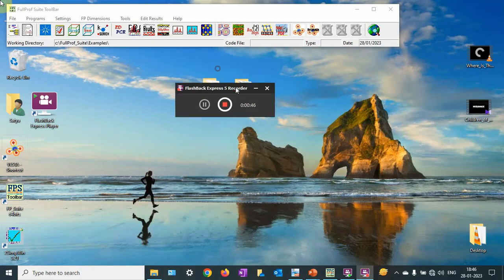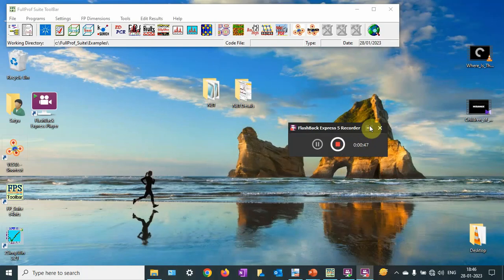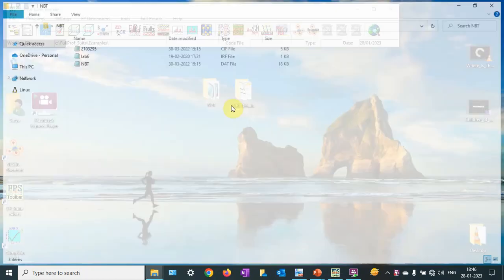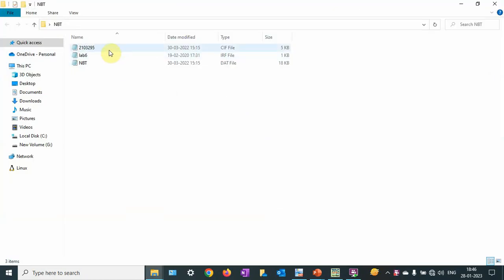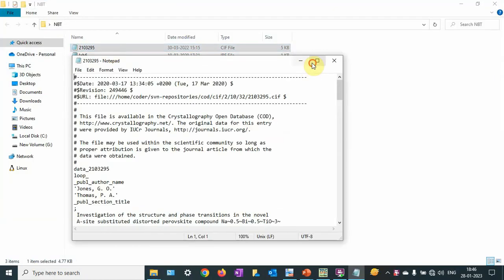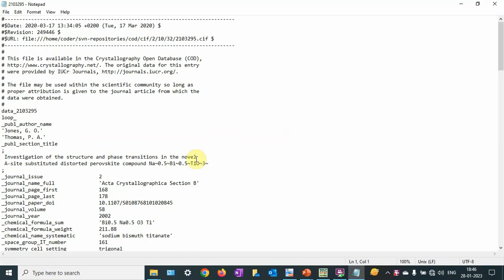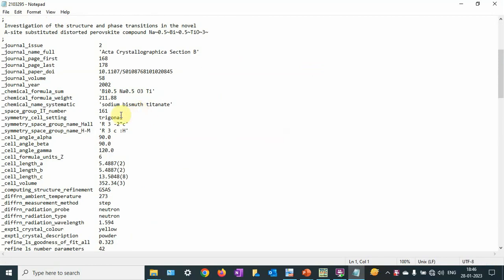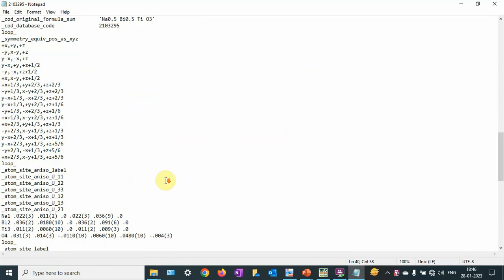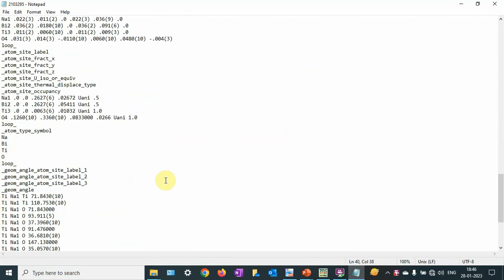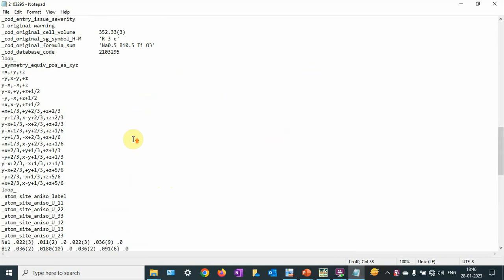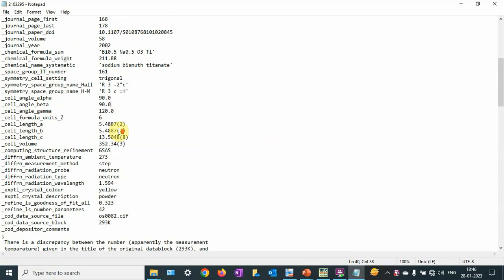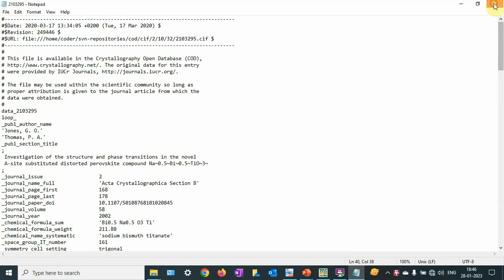So we need three files. The first is our crystallographic information file. You can see that here we get lattice parameters, space group, and atomic positions of sodium bismuth titanate, or NBT. We are going to use this model to refine our crystal structure.